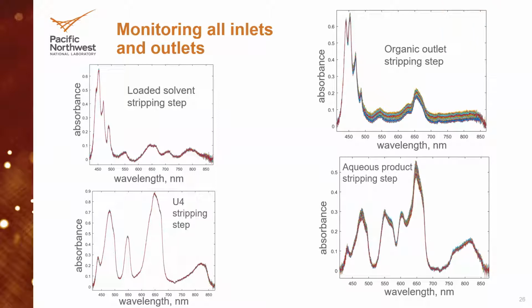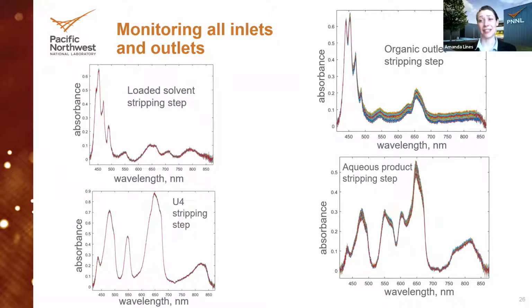So I see a big challenge with using optical, online monitoring, at least in the case of molten salts, is, since they're so corrosive and aggressive, the optically transparent material just really isn't there right now. I mean, has there been any work on what kind of window material might be appropriate for a long-term monitoring system? Yeah, and that's a really good question.